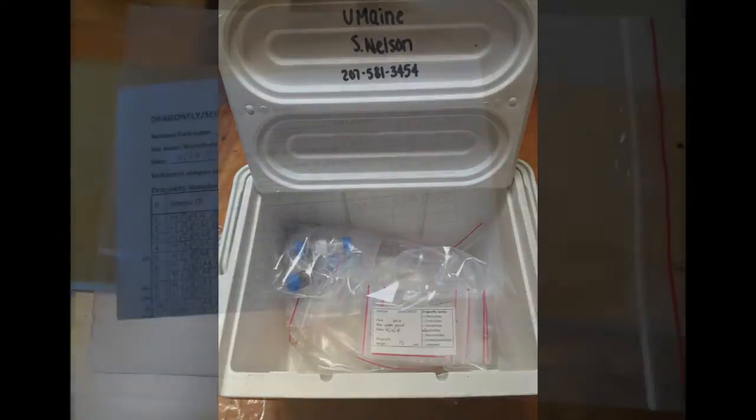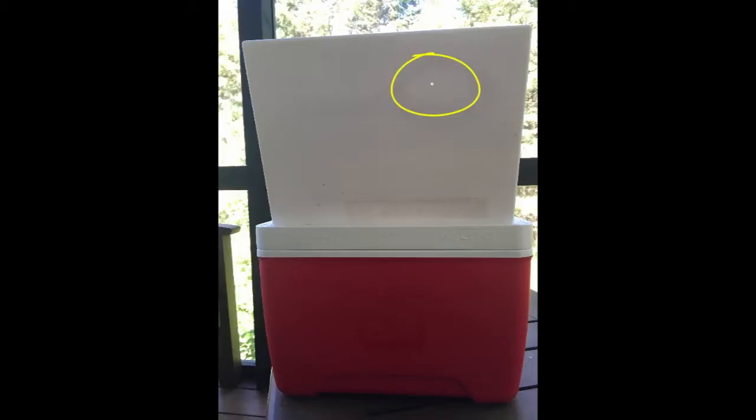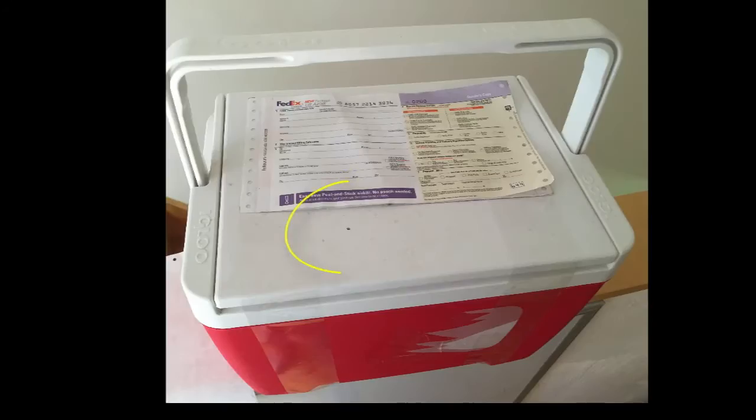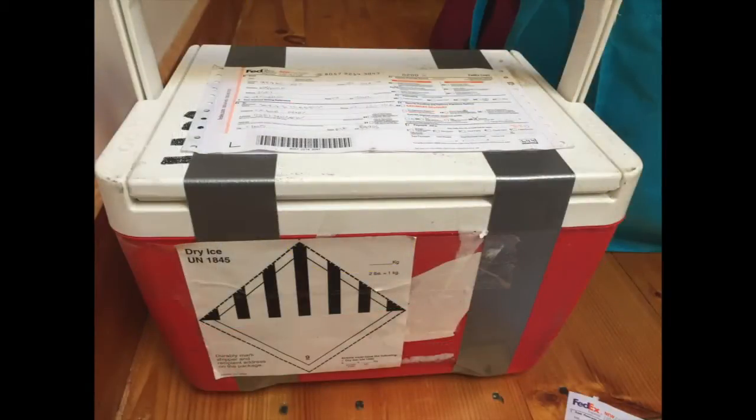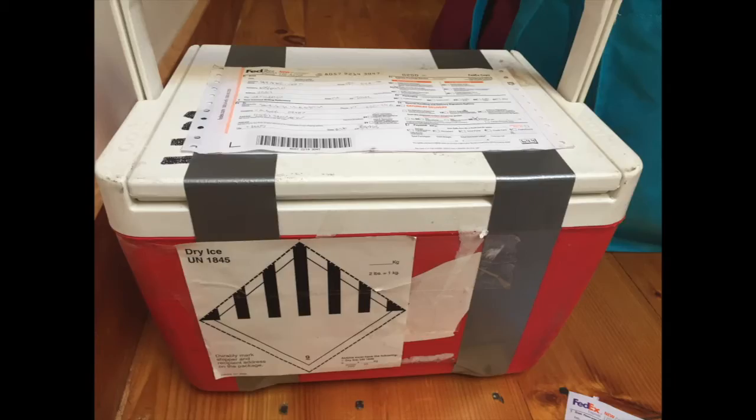Place the samples in the cooler with the dry ice. Place the field data sheet in a zipper bag, seal the bag, and place that in the cooler as well. There is a small vent hole in the top of the coolers being used for dry ice shipments. This vent hole must remain open — do not cover it with the shipping label or packing tape. Seal the cooler with tape, put the shipping label on the cooler. The cooler must have the dry ice label included in the sampling kit, affixed with waterproof tape.